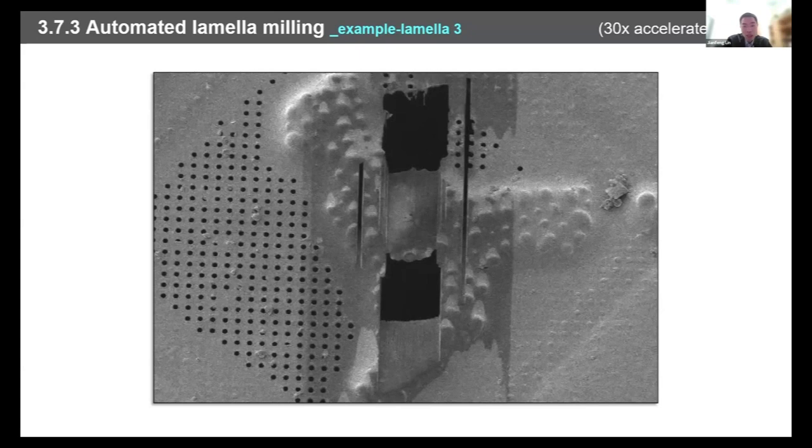Also look back to the time you waited there, and based on that make a judgment. But longer is not good. I didn't calculate the time, but as far as I know, people feel uncomfortable keeping the lamella there for more than 4 hours.